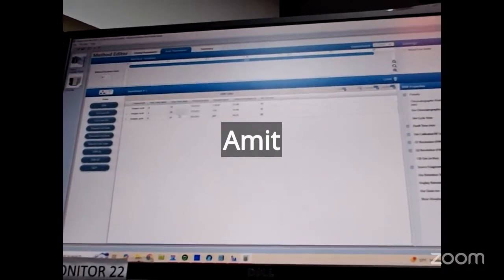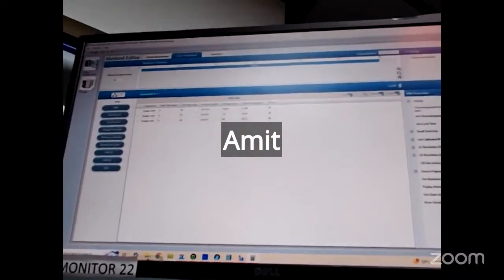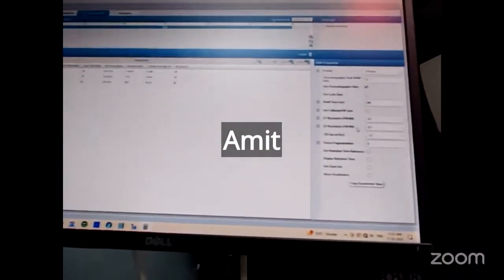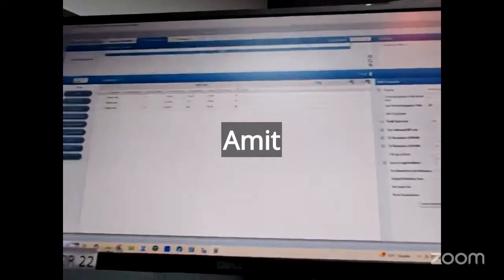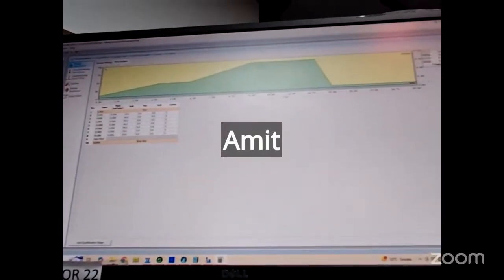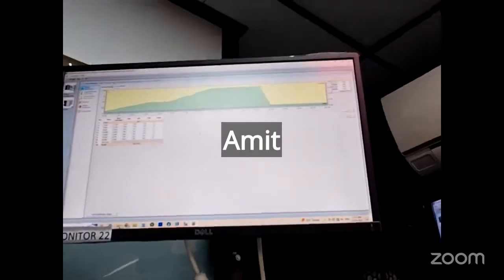And the start and end time follow the chromatographic gradient that we are keeping. Here, this is the quadrupole 1 resolution and quadrupole 3 resolution, that is, how much delta we allow to pass. Now after this, we give the analysis. If I show you the gradient, this is how we give a gradient of 20 minutes, where the hydrophobicity is increasing.